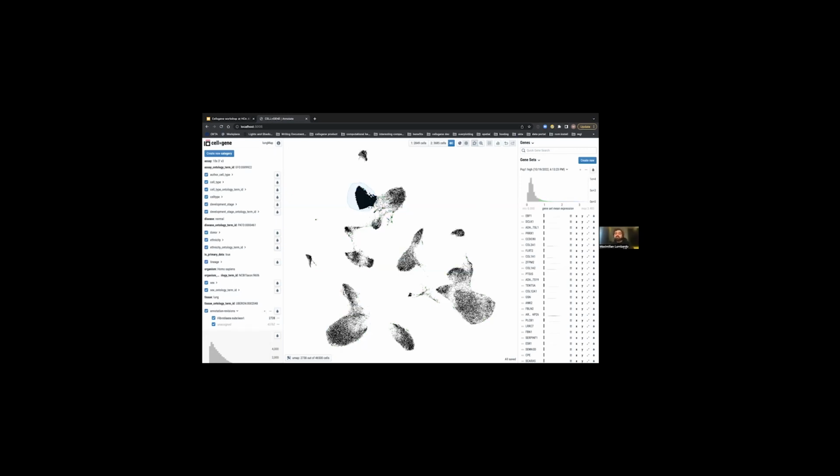Instead of doing the manual selection this time, I'll go ahead and actually select based on the histogram here. So here I'm selecting those cells that have a low score for this particular set, so that these are the complementary subcells to what I had selected previously, although it looks like there may be some overlap. Let's see what happens.